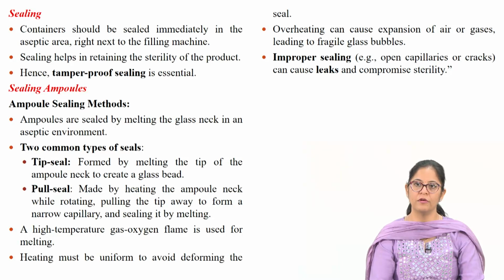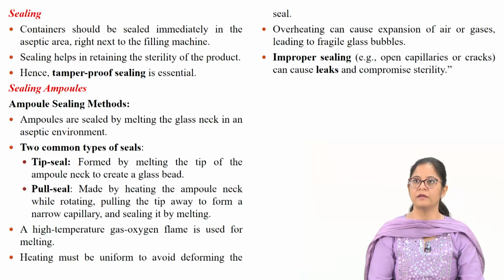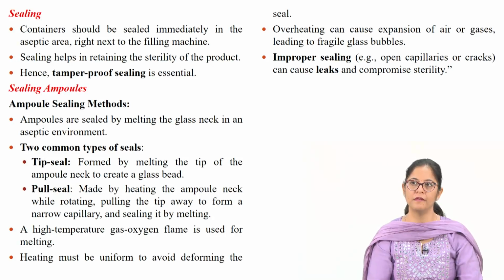Heating must be uniform to avoid deforming of the seal. Overheating can cause expansion of air or gases, leading to fragile glass bubbles. Improper sealing, that is open capillaries or cracks, can cause leaks and compromise the sterility.